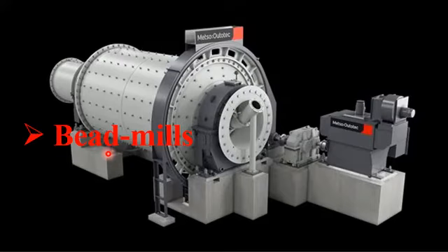Bead mills usually grind and disperse the bulk material down to micro or nanometer scales. In bead mills, beads or gravels are used as a grinding medium. They are also an important part of the cement industry.